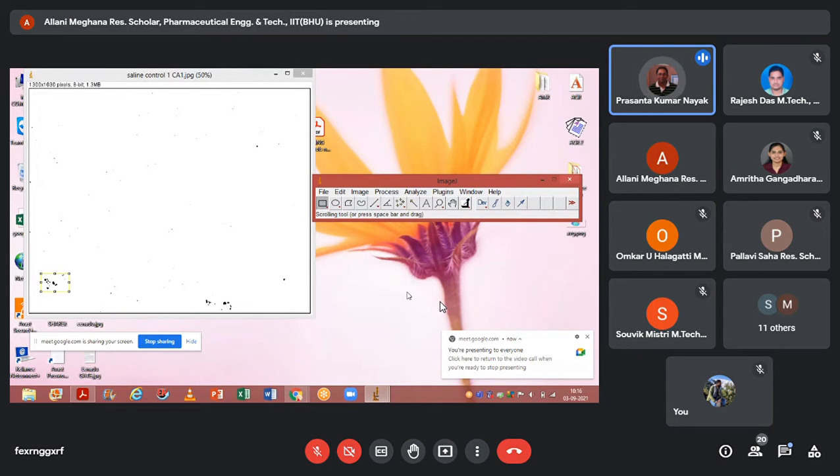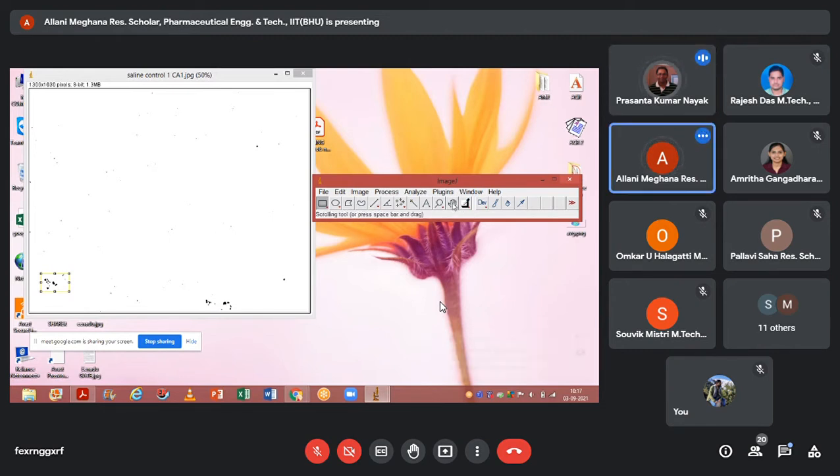So you find what you missed. I'm telling you, when the cursor is coming as a plus sign, it is because from the tab you have chosen the rectangle selection tool. Can you see that? On the left, first one, first below the file. That is selected. Yeah, that is the rectangle selection option. That's why it is allowing you to select.